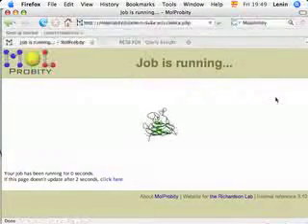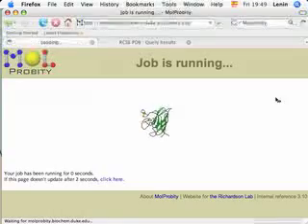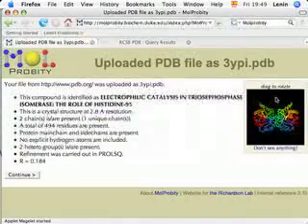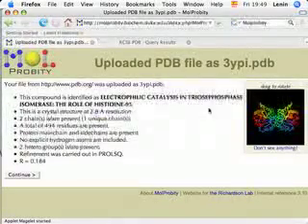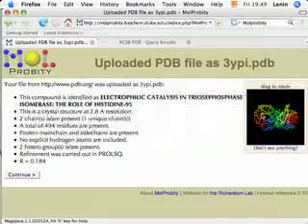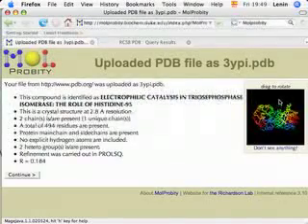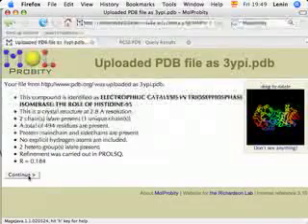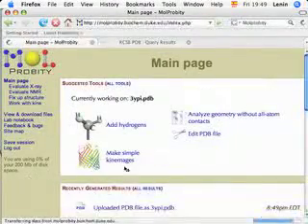Let's start using the structure with the lowest resolution. At this screen we can review the structure data and then proceed to add protons. This step is particularly important for side chains such as histidine, asparagine, and glutamine.